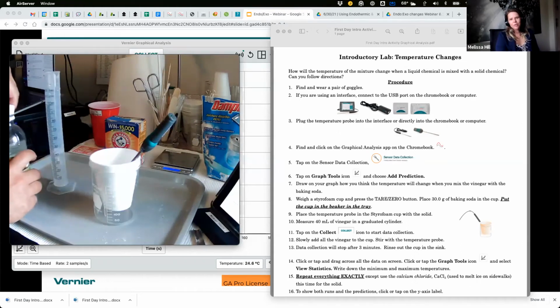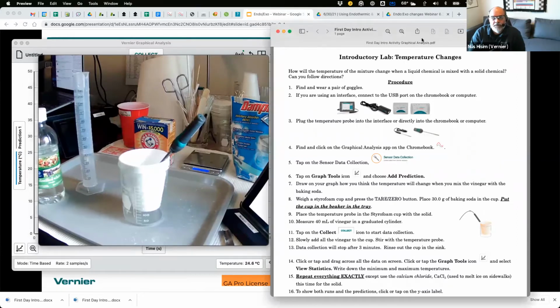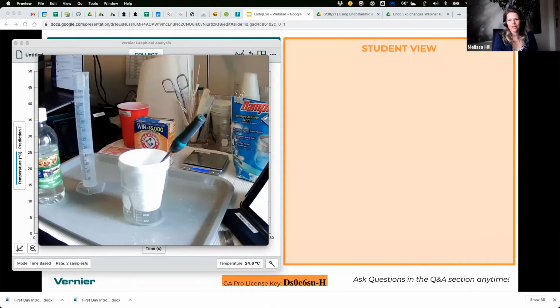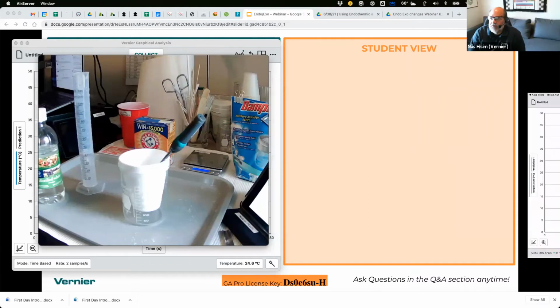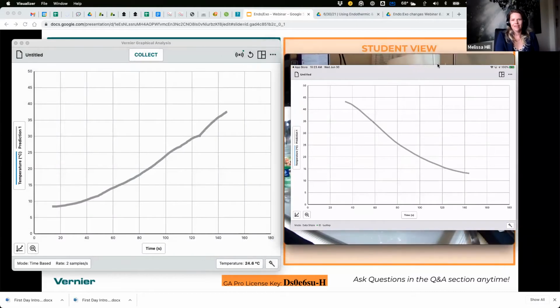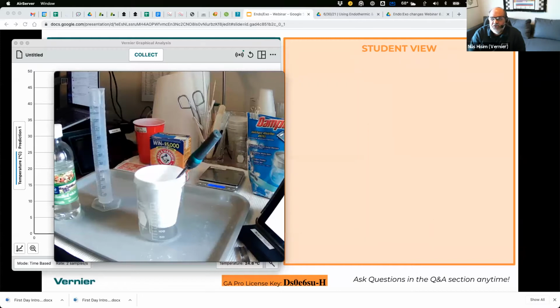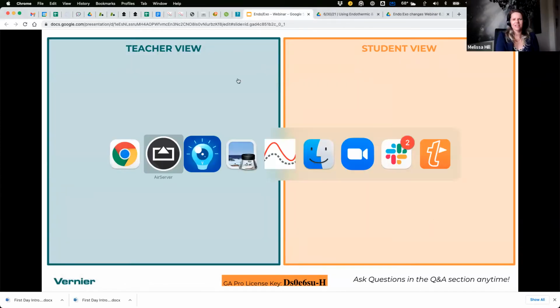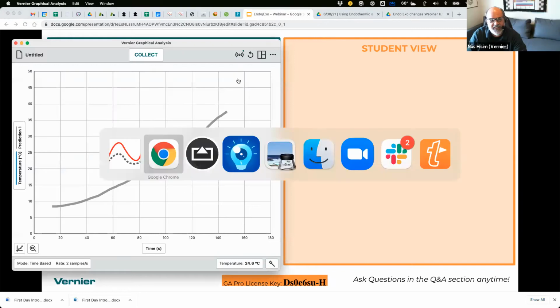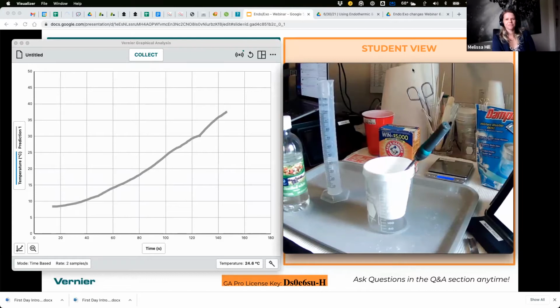Go ahead. Hey, Noose. Yeah. Can you put the data up next to you're showing the experiment and hide the instructions instead? Yep, I sure can. And people want to see the data if they're not able to join. So they're good. Yeah. Okay. Yeah. All right. Awesome. Thank you. Is that good? Like that? Yeah. Well, put it in front of the. Yeah, it's weird. It's the air server takes over. That is weird. I didn't know the air server took over like that. Yeah. That's first time I noticed that. So I'll tell you what, I'll put it like that. They can see what I'm doing.